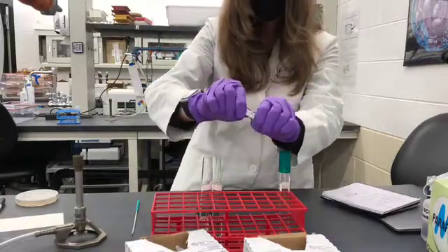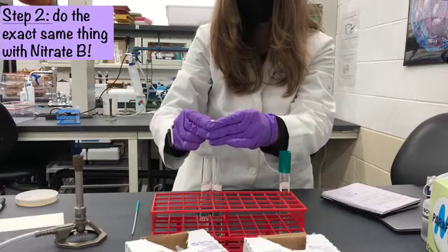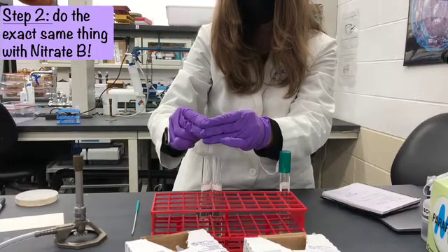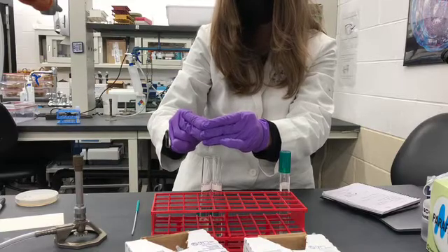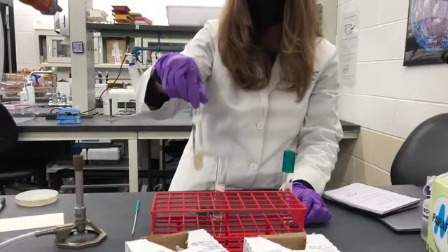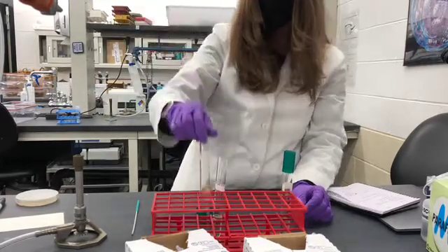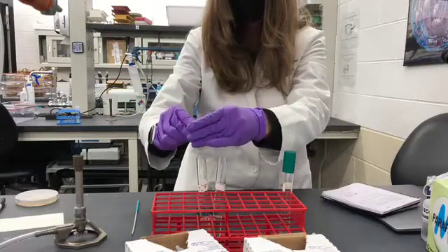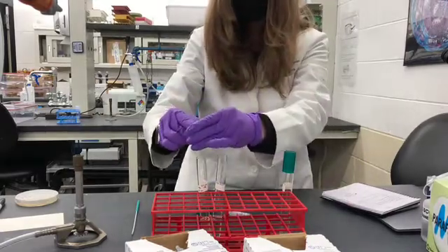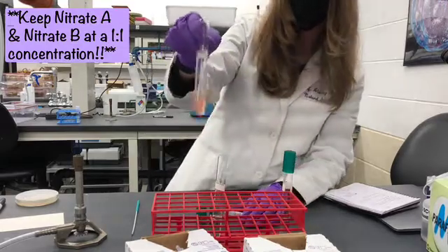For Nitrate B, we follow the same steps, adding about five drops into each sample. It's a little harder to control than expected. You mix them and you're looking for a color change. You just want to make sure that your Nitrate A and your Nitrate B are at a one-to-one concentration, and as you can tell, you don't have to be perfect about it.